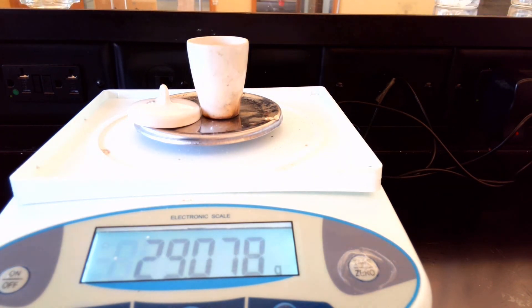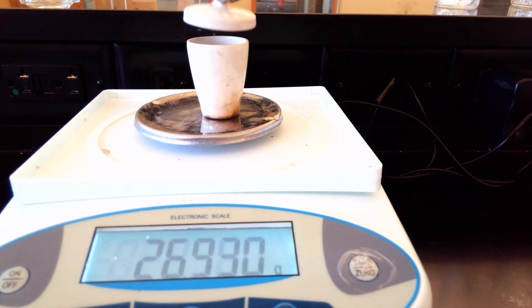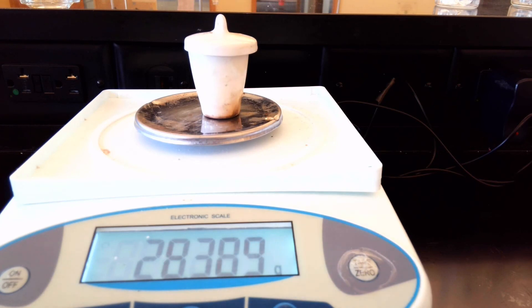So there we are. Our new mass now with the crucible and the lid — we'll put the lid back on. Crucible, lid, and salt. The mass is 29.078 grams. That is the mass of the crucible, lid, and salt.